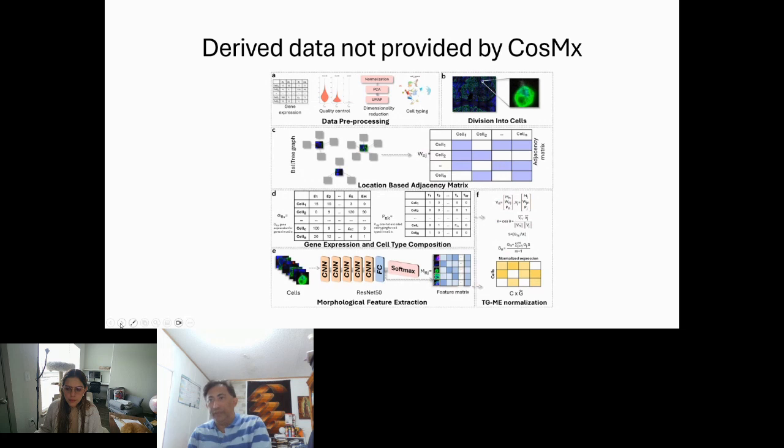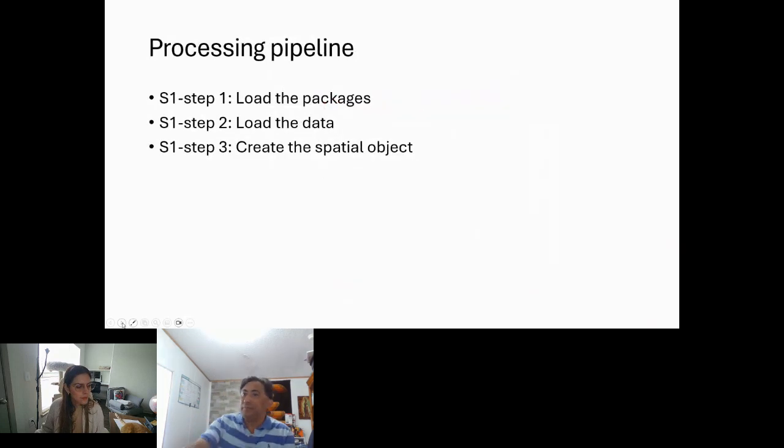One of the situations with the environment that we use, Jupyter, is that it's very good because we have many functions and everybody is sharing. At the same time, for some aspects, it's not very robust. If you have a different library, or you download a different date, it may not work. That is the way it is. Well, let's try. Go ahead, Carl.